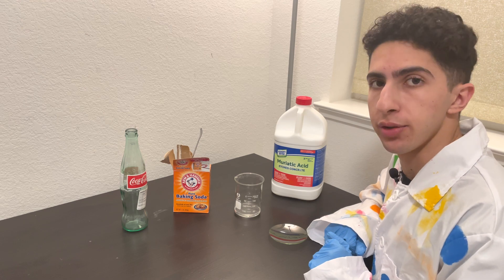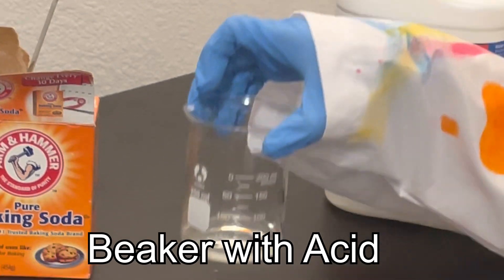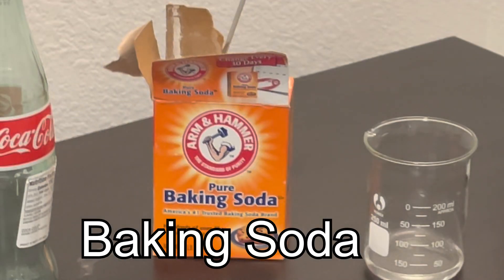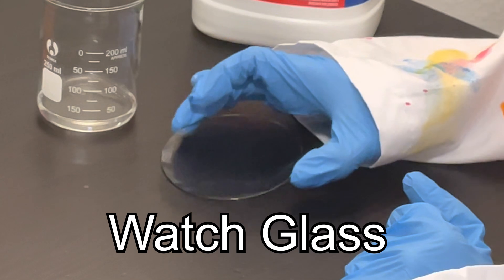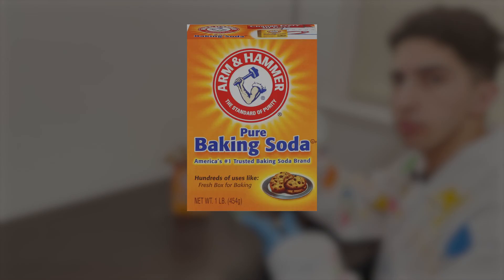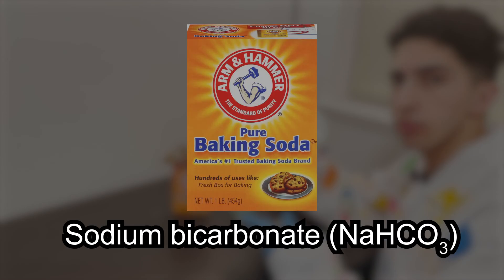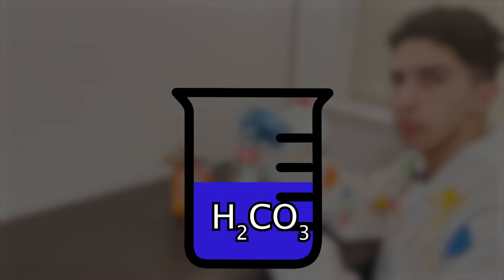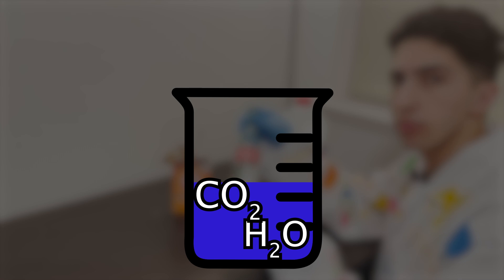Here are the materials I used: a beaker filled with concentrated hydrochloric acid, some baking soda, a little watch glass, and a glass Coke bottle. Baking soda is actually sodium bicarbonate. The bicarbonate ion reacts with acids, which provide a source of protons, to form carbonic acid. In aqueous solution, carbonic acid quickly decomposes into water and carbon dioxide, which evolves out of the solution as bubbles.